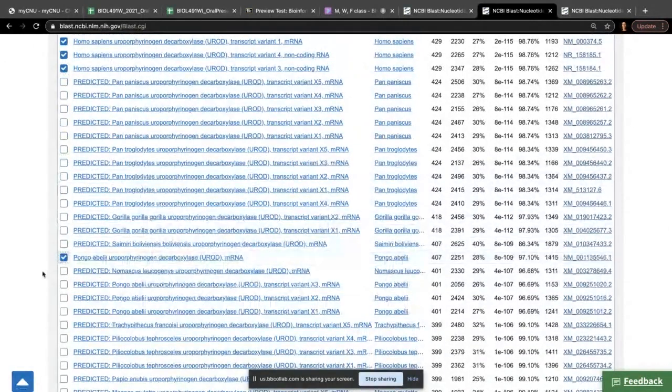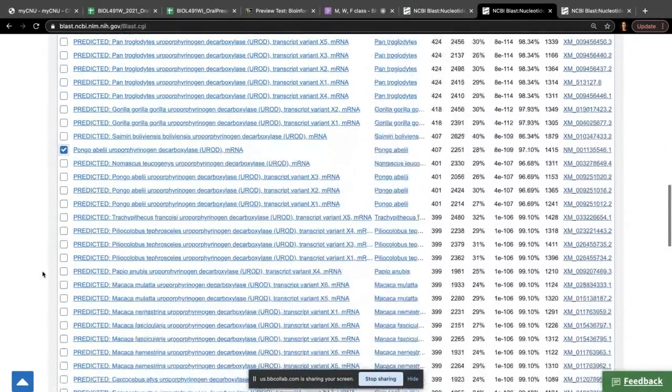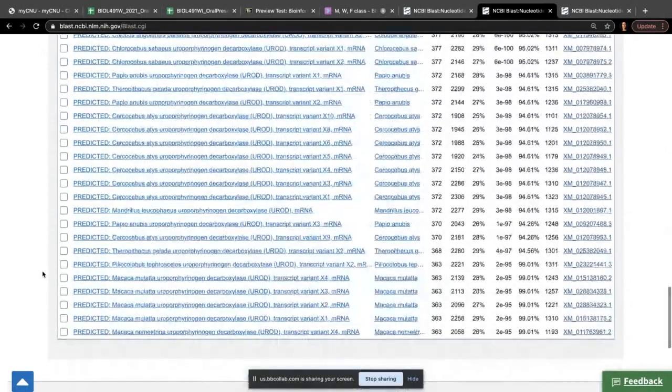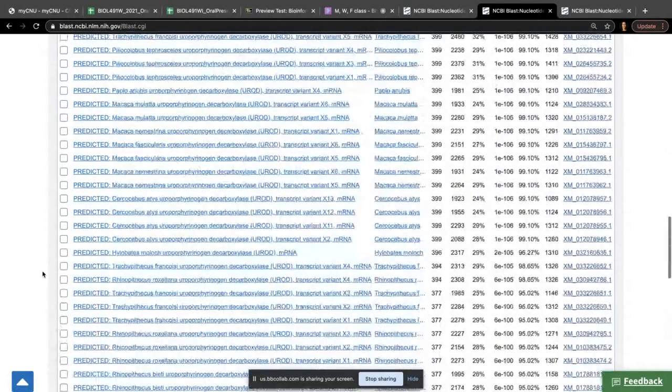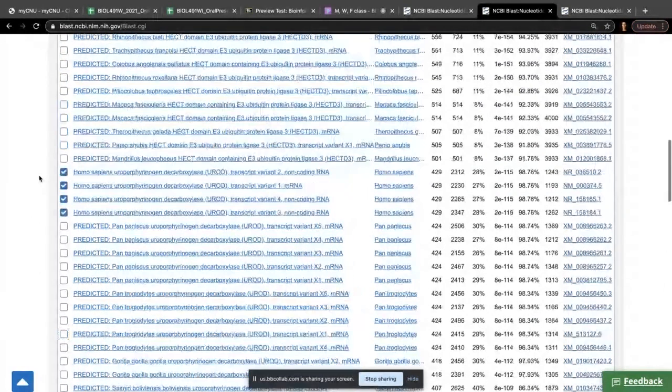Okay, this is some other organism. It's not human, but we could see what it is related to. But if my question, I'm telling you, is that this DNA is from humans, then the most reliable results would be to narrow down to humans. And I don't really care that much about predicted. I only pay attention to predicted whenever I didn't really get that many hits. Then I'm like, okay, then I'll settle for something that is less trustworthy.